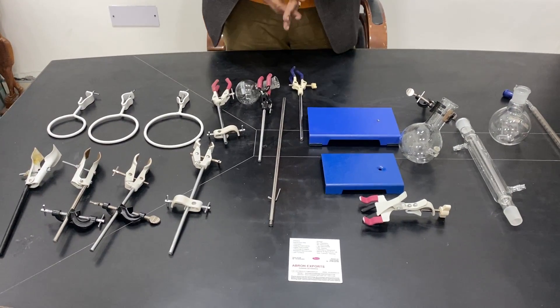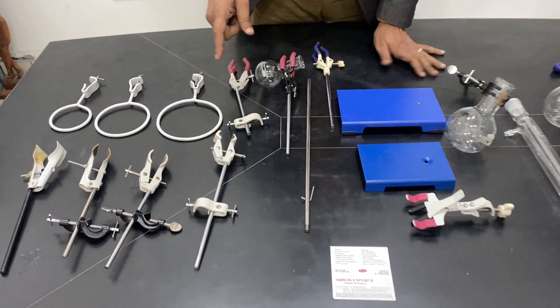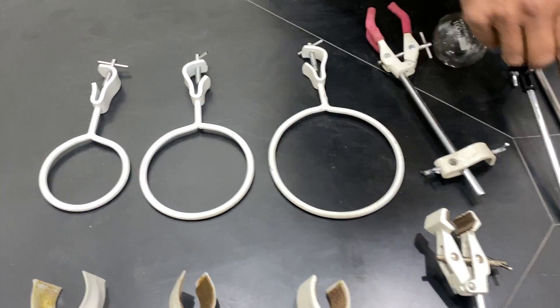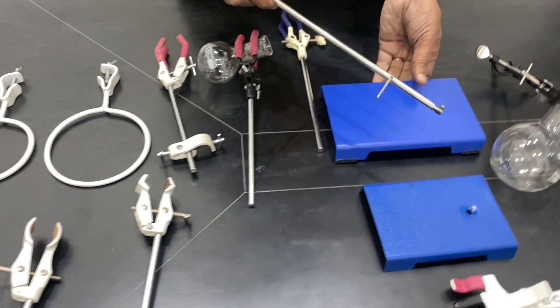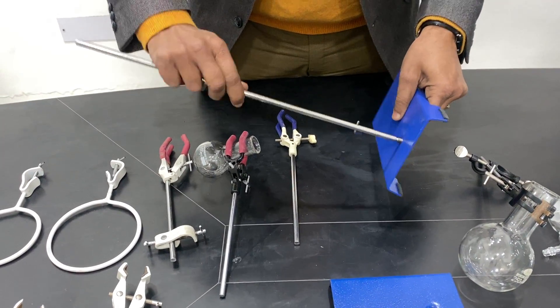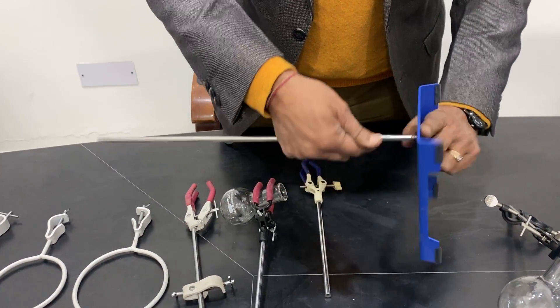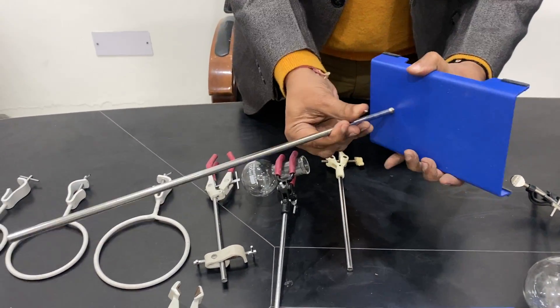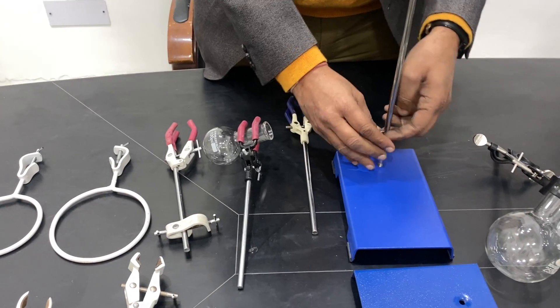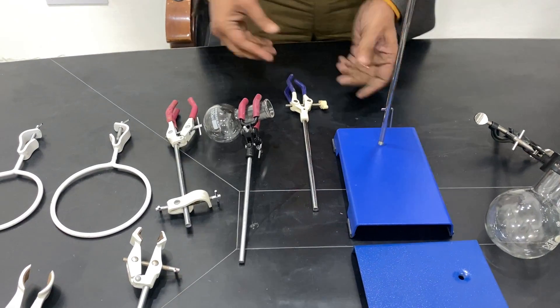These are iron stands used for holding glassware such as flasks or separating funnels. There are three types of stands, consisting of one rod and a base. The base sometimes has rubber feet or a leveling screw. When you fix the rod on the base, there is a wire used to tighten it securely. Once fixed properly, you can rotate it to confirm it does not move.